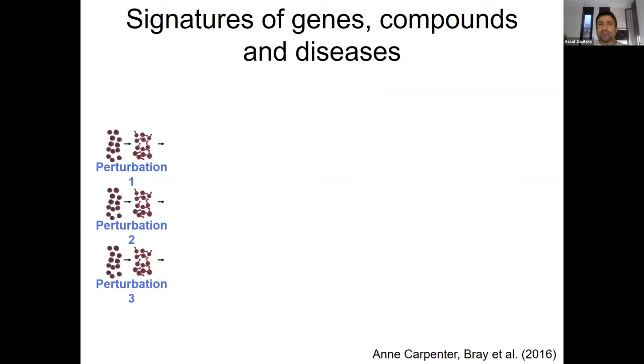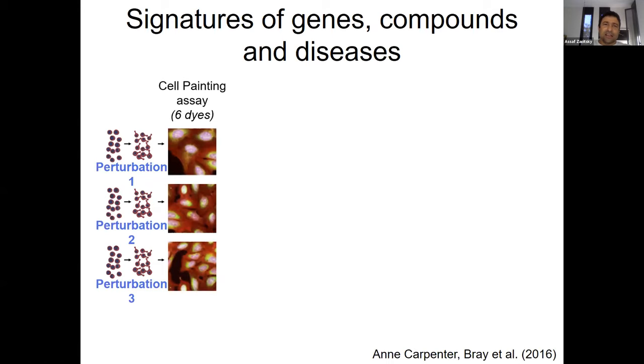So, signatures of genes, compounds and diseases. One assay that is very common now in this domain is cell painting. I have another slide on that. In principle, the idea is to image in parallel multiple markers within your cell.